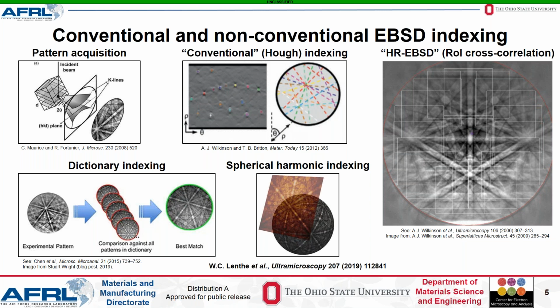The relative orientation of two similar scan points can be determined with extremely high precision, better than 0.01 degrees in optimal conditions. However, it has difficulties handling large changes in relative orientation, as the patterns will have shifted to the point that there is no overlap for cross-correlation without further processing. It also requires very high resolution and high quality patterns for best precision.